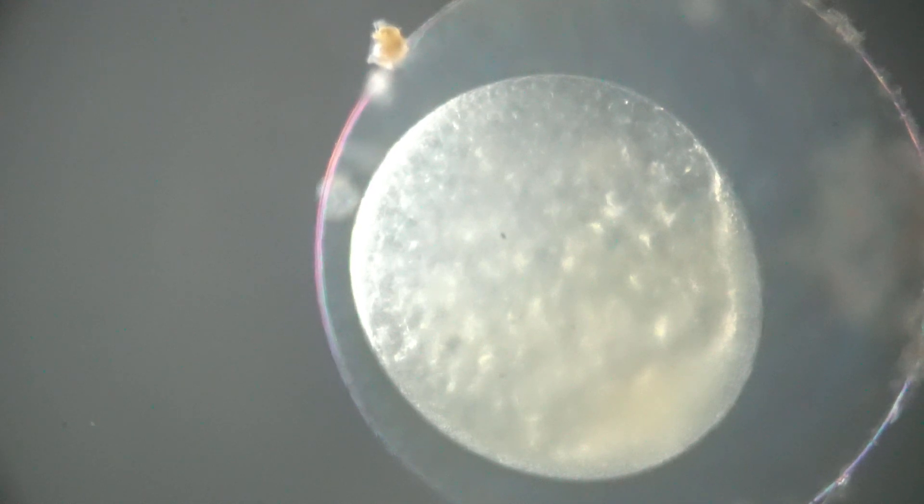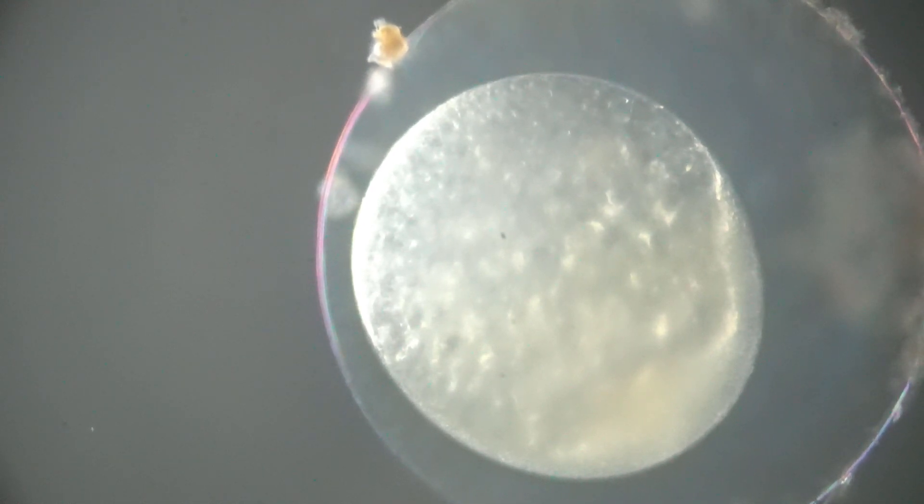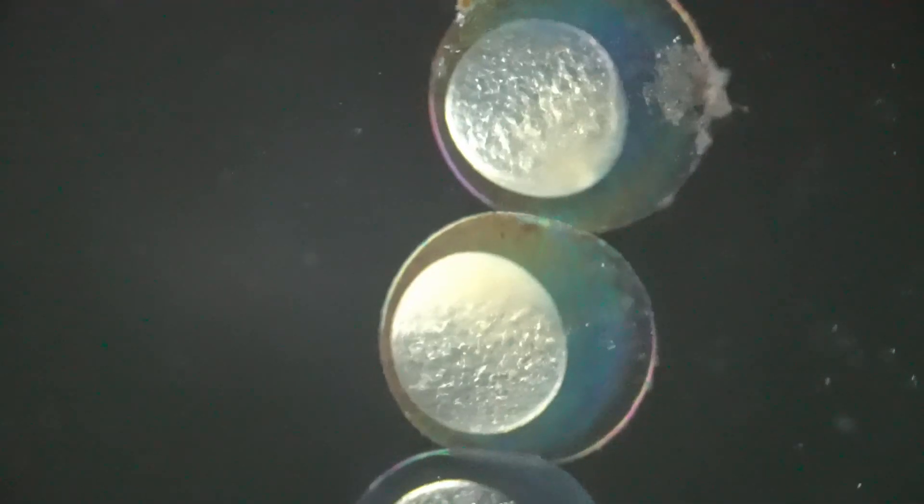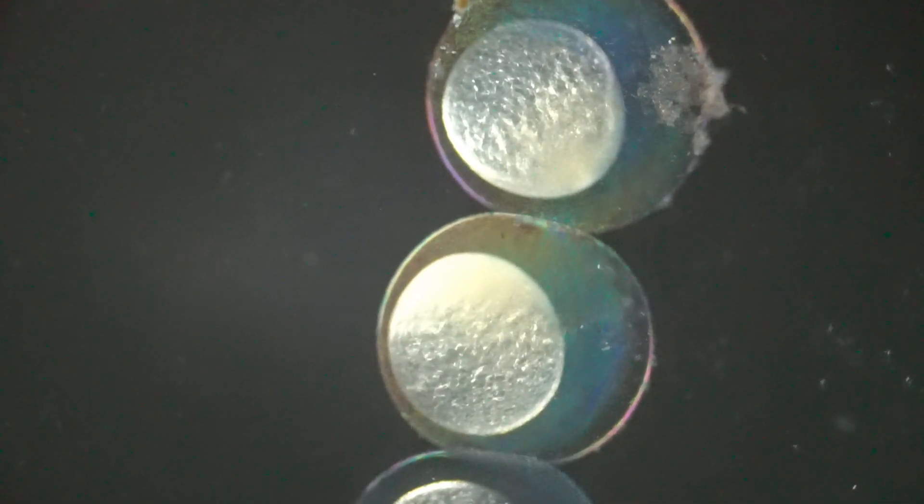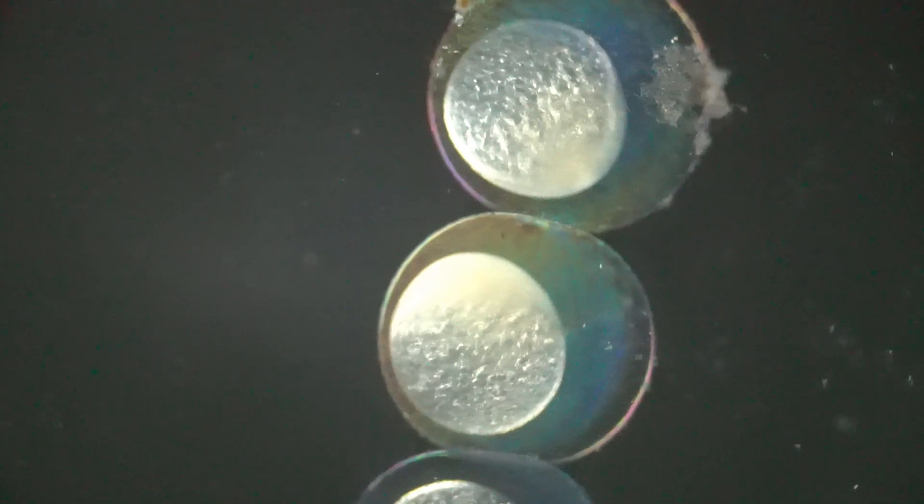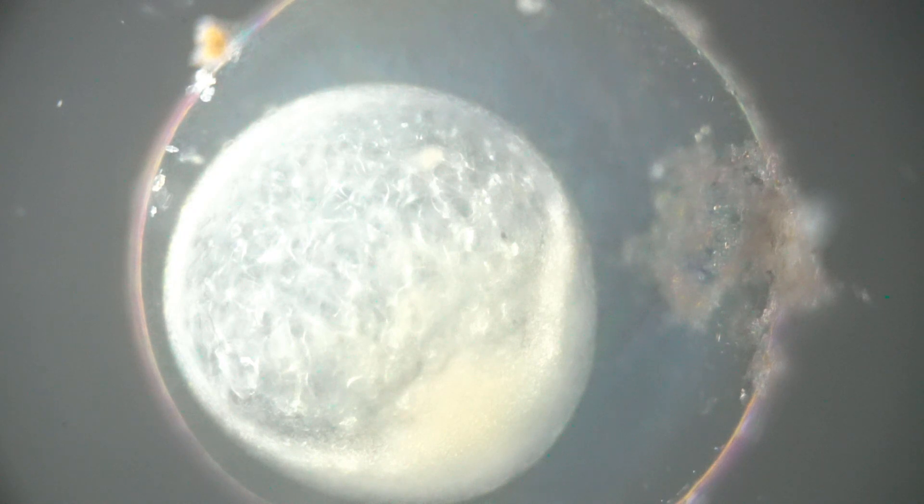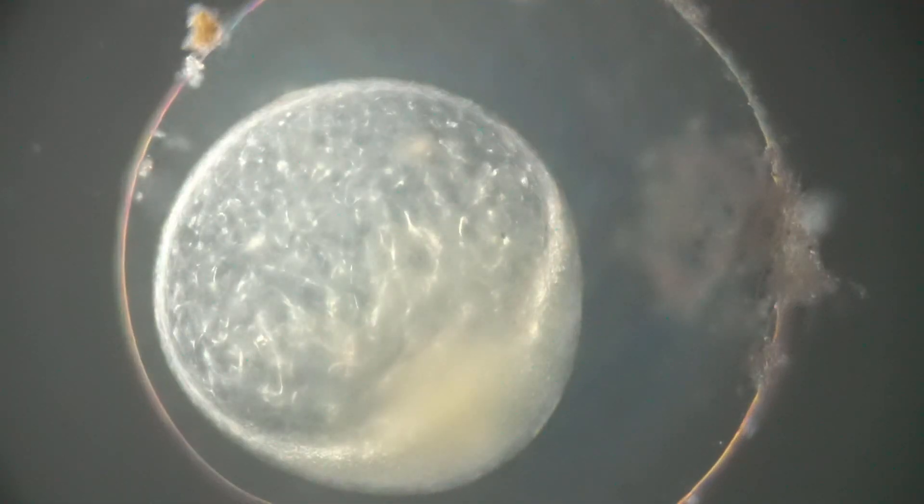You can see that the cytoplasma is starting to congregate on one side of the ovum. This is the beginnings of a zygote. As that cytoplasma starts to develop on that one side of the ovum, it starts to become what is known as a blastodisc.